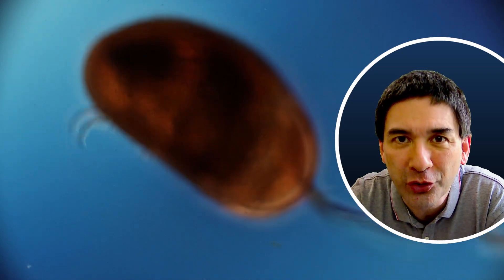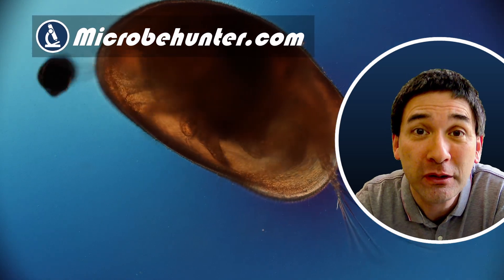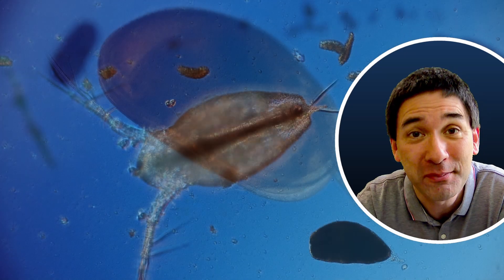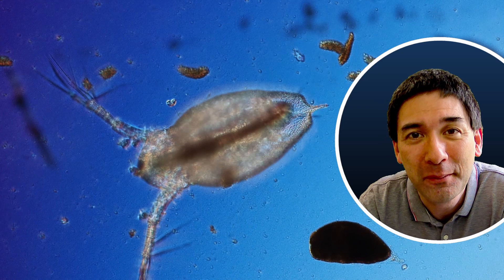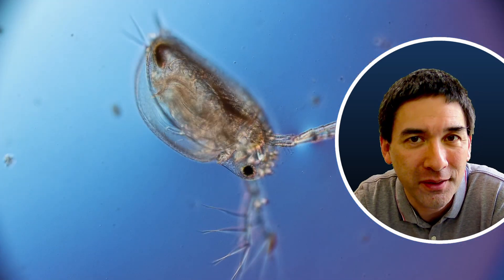This here is a small ostracod that I found in some standing water inside a forest. Ostracods belong to the crustaceans — and look, it just pooped here. I'm going to show you several crustaceans that are pooping in this video, but I also want to show you how I caught them and how I put them under the microscope.